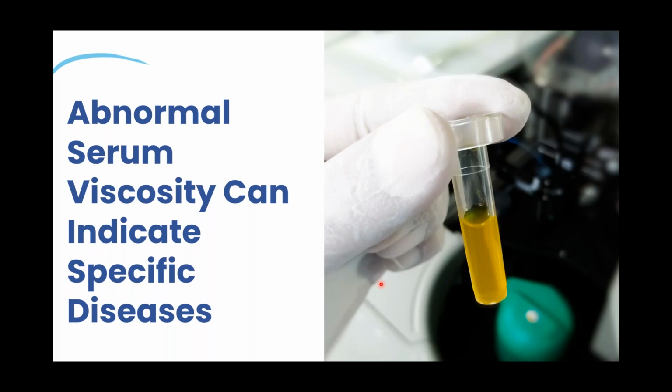So do you take the vial and slosh it around and see with your eyes? Well, no, this is not very quantitative, as you know, and besides, the viscosity of blood serum is less than 10 centipoise, so it can be difficult to detect viscosity differences for this range, even with other rheometers like coaxial sensor systems. So although there's not an exact number that is characterizing the high versus normal viscosity, a healthy serum has been listed around less than 1.5 at body temperature.